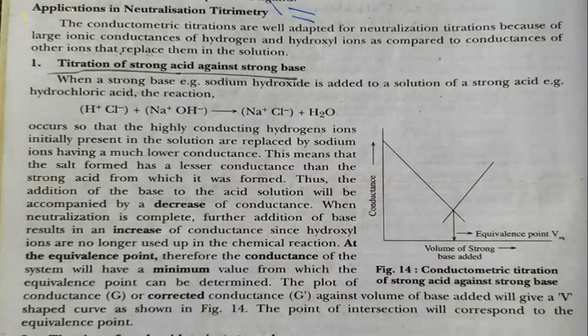What are the applications of neutralization titrimetry? Now see here, the titration of strong acid against strong base. This is the first application. HCl against NaOH. What we see in this titration is that first the conductance decreases. When neutralization is complete, further addition of base results in increasing conductance, as hydroxyl ions are no longer used up for the chemical reaction.